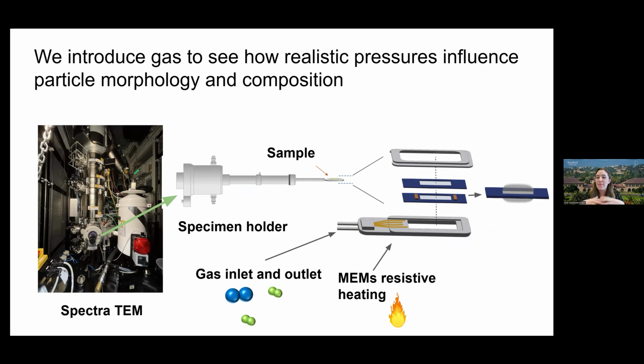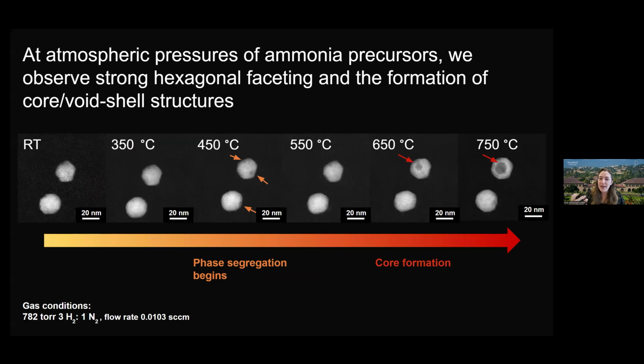So to nerd out a little bit, these experiments are notoriously difficult, and part of it is because we're dealing with huge pressure gradients. If you think about the pressure inside of a TEM column, we're talking roughly 10 to the minus 7 millibar, and we're working with pressures on the order of 1,000 millibar. So our tiny 50 nanometer silicon nitride windows are separating a differential of 10 orders of magnitude. So these experiments are not for the faint of heart, but they are rewarding.